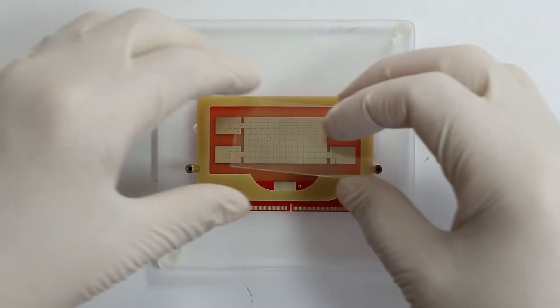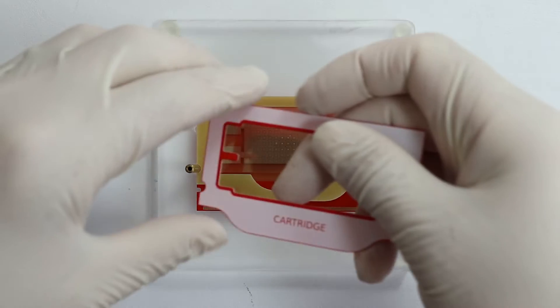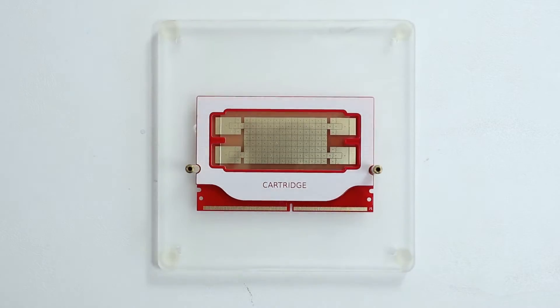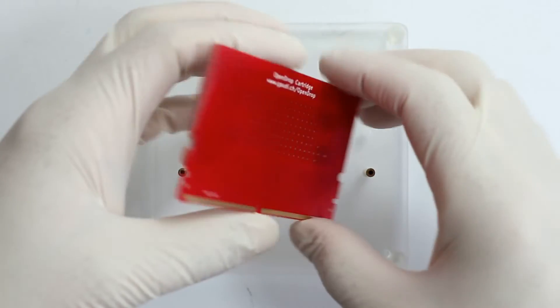The electrodes are covered with a conductive ITO glass, and the whole cartridge is held together by a top frame. This makes for a compact and fully PCB and ITO glass based cartridge.